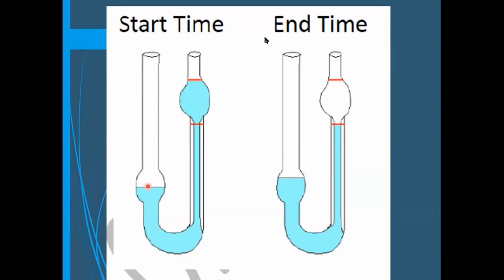That means the viscosity will decrease and the resistance of the polyvinyl alcohol molecules will decrease. That means the flow time will also decrease. Now again, same process: calculate the flow time from point A to point B, and this is T2, the flow time for solution number 2, because we have different concentrations. Now again, add another 2 ml with brief shaking.